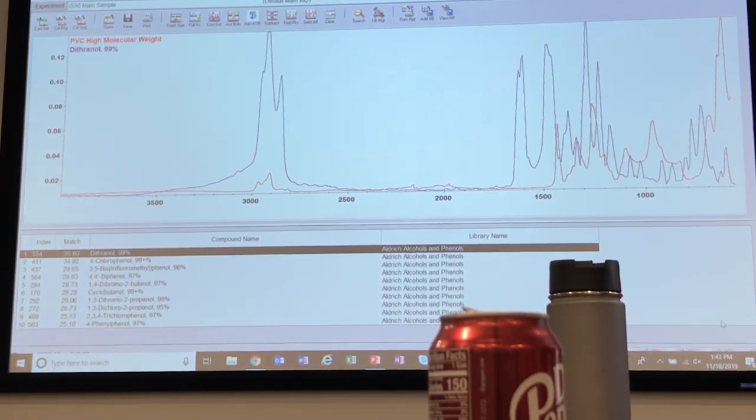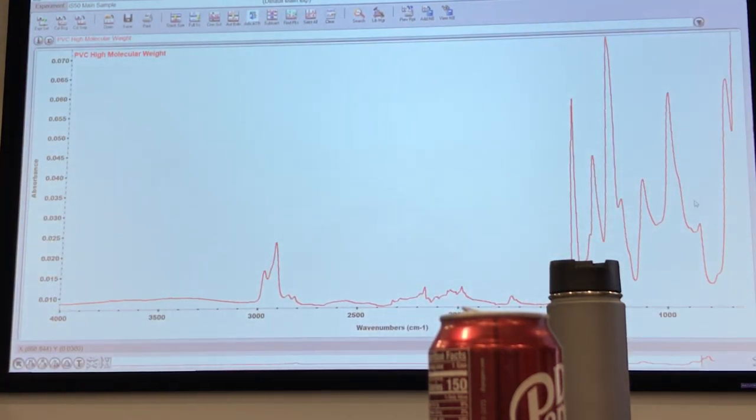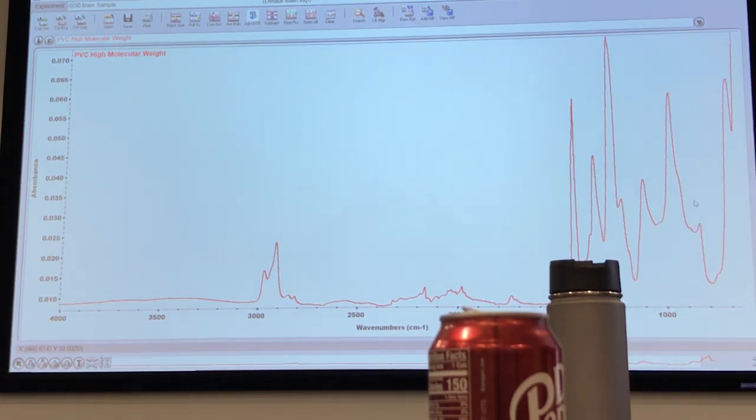Okay, so this one was fairly straightforward, but let's bring in one more spectra. So this is what you may see a lot. A lot of you folks are so interested in this whole idea of microplastics also because this is not good for anybody, actually. So PVC is one material that gets a lot of additives added onto it. One of the most common ones that gets added is phthalates, because that makes PVC really pliable so it can be bent and so forth.